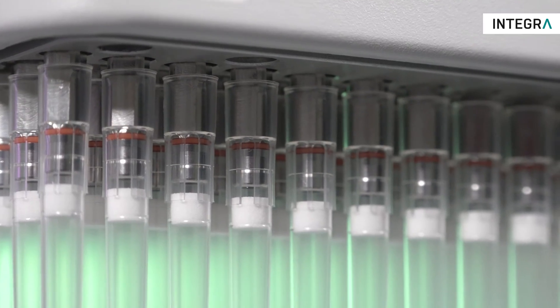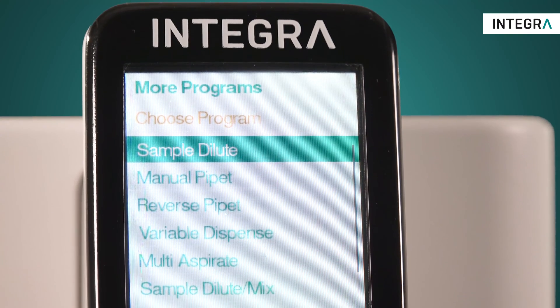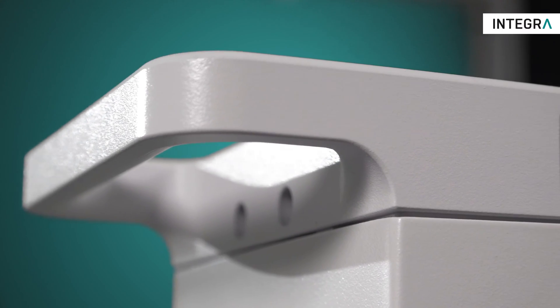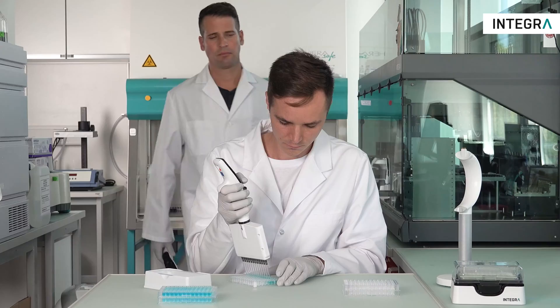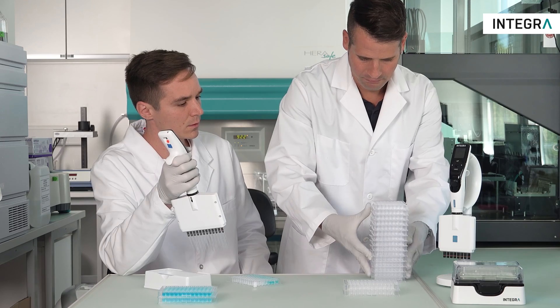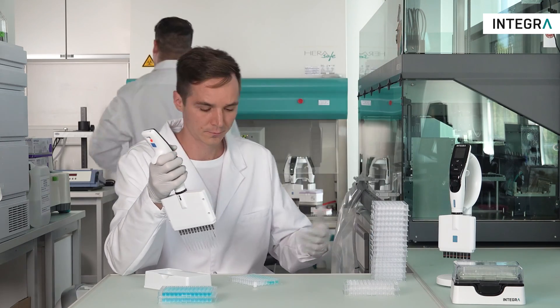Filling 96 and 384 well plates is standard practice for countless labs, with higher throughput and better results often being their goal. Everybody wants to be more productive. Traditional single 8 and 12 channel pipettes are affordable and can be easily transported around the lab, but at some point they simply reach their limit in terms of productivity.